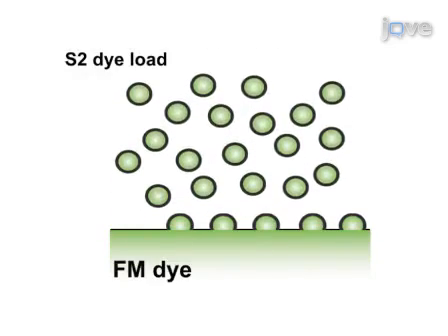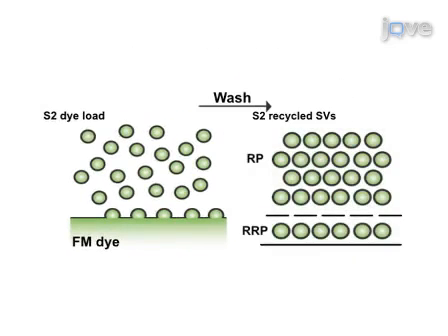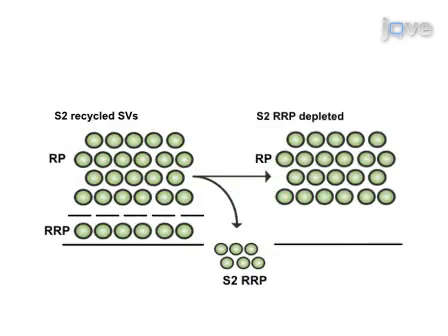Next, change either loading or unloading conditions in order to study the effect of the chosen variation on either synaptic vesicle pool replenishment or mobilization.